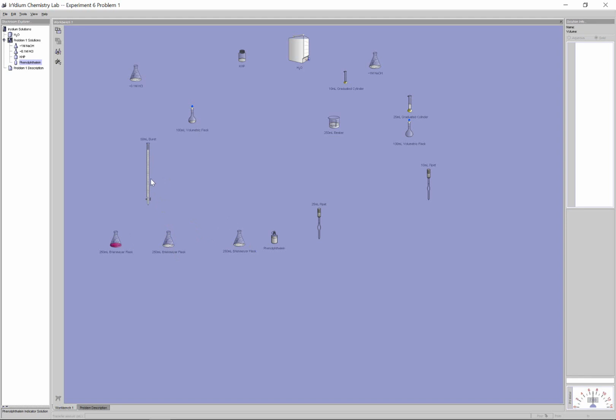So right now here, there's my buret reading here. I'm going to drag it over my second trial. My second trial, make sure you do your initial reading. In this case here, it's 4.22, let's say. I'm going to do my titration. The other one took about 33.01.